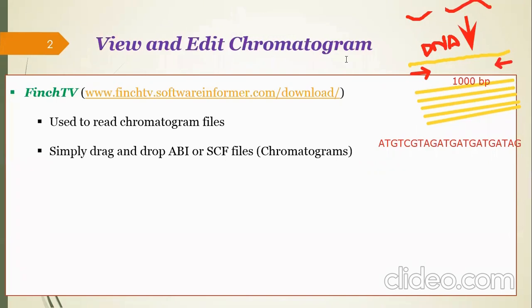After doing that, we sequence this. So this is the sequence that we got from this product. This was through PCR, and this is through sequencing.